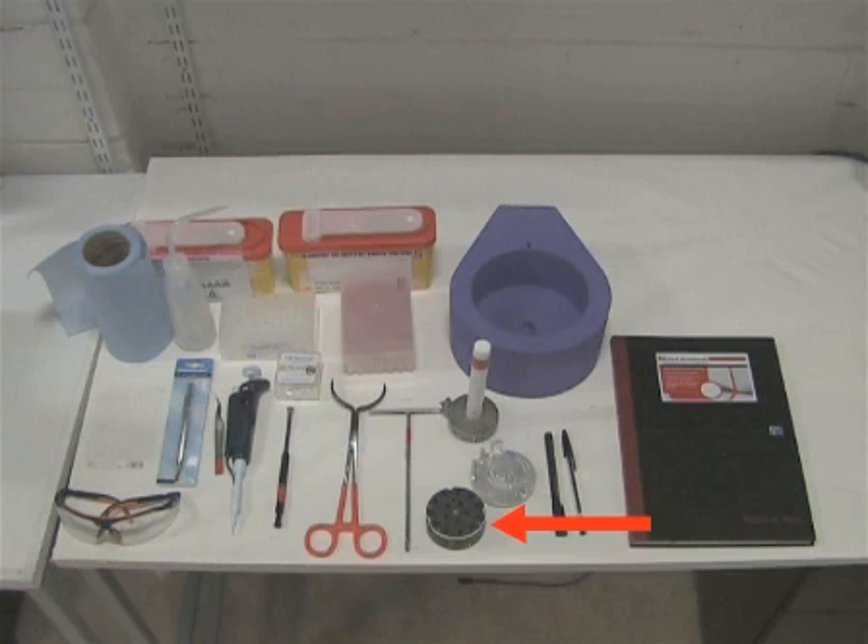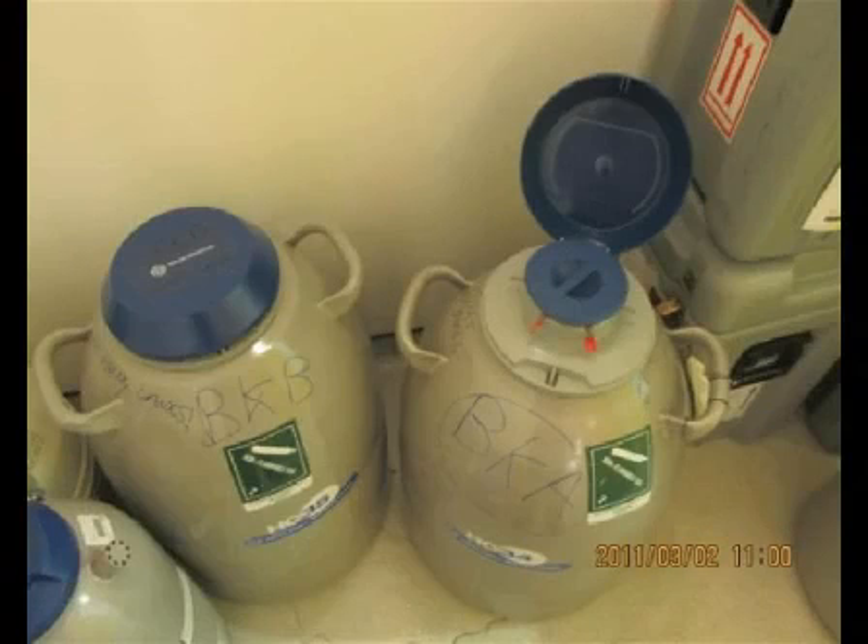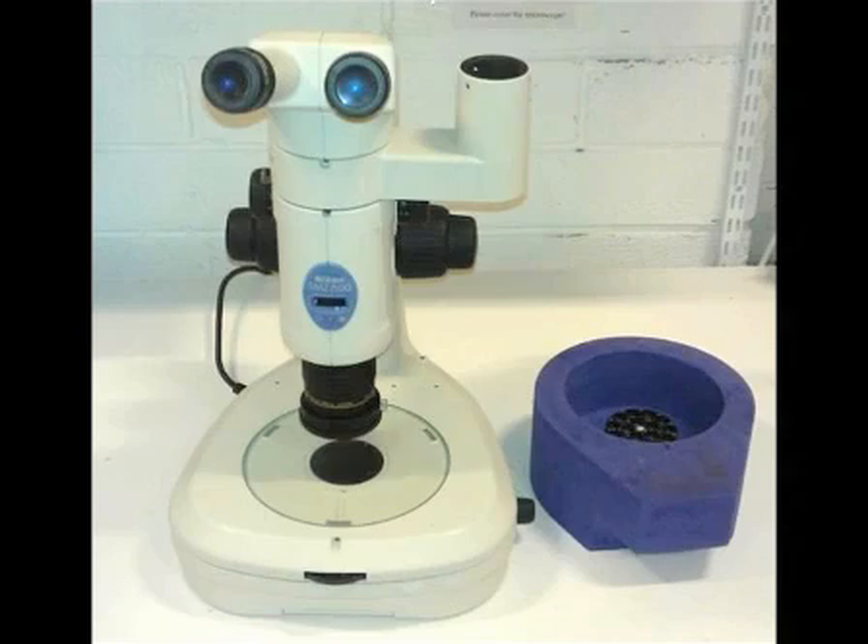A puck for storing cryocooled loops containing crystals, a foam dewar filled with liquid nitrogen for cryocooling the crystals, tongs, a transport or storage dewar, and a harvesting microscope.